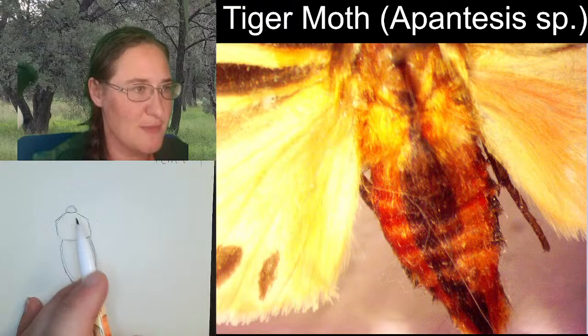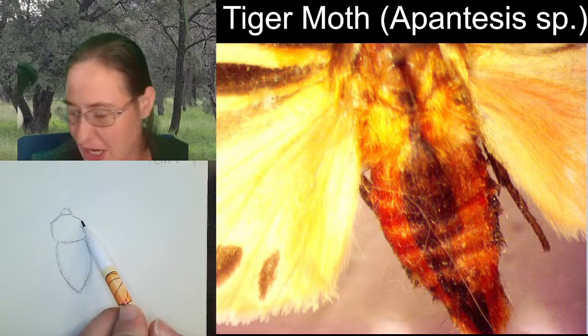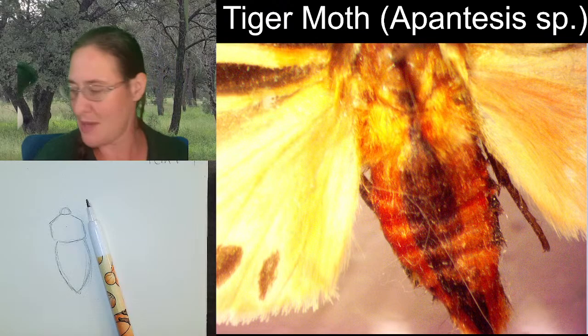Now, I'm gonna get us an estimate on our wings here. We're gonna come down to where the thorax is more straight, like this vertical line here, and then we're gonna pull it out. We want one wing, so let me get a measurement on the one wing. I guess we could split it in half.